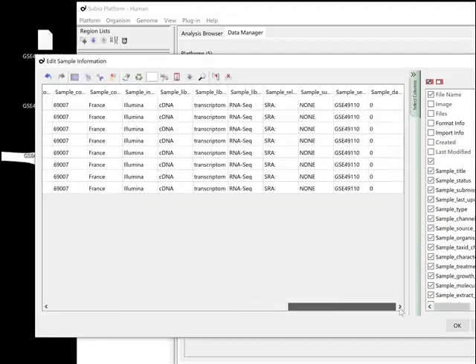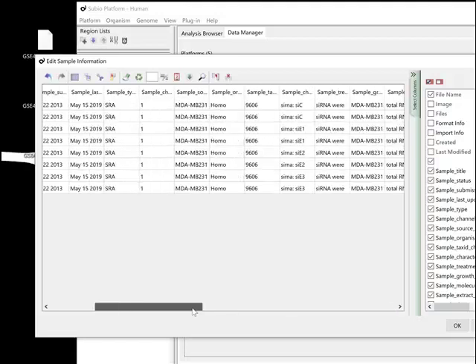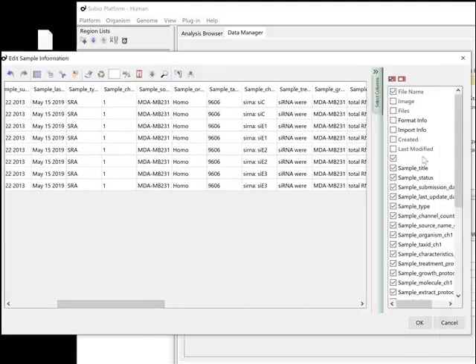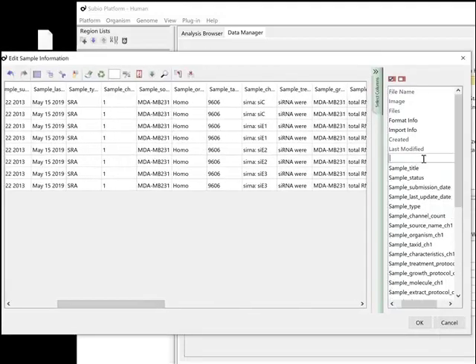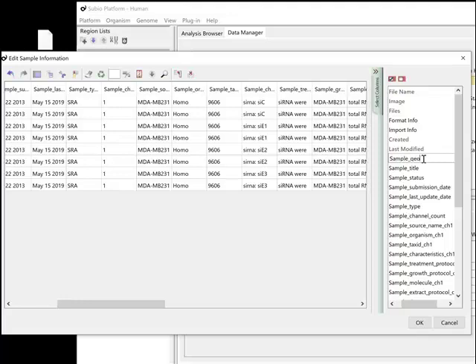Now you have information describing the samples. Fill all titles and save it.